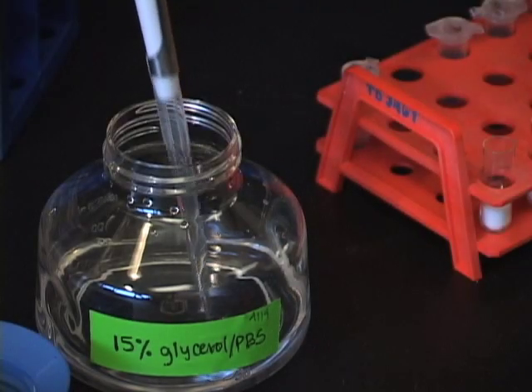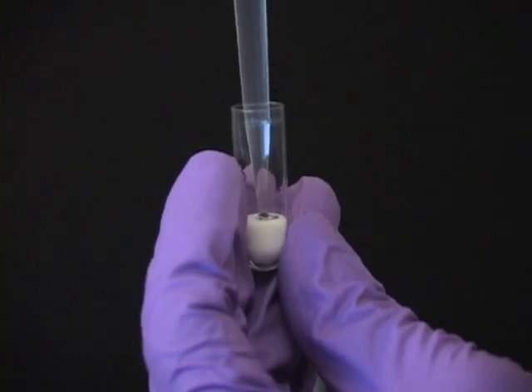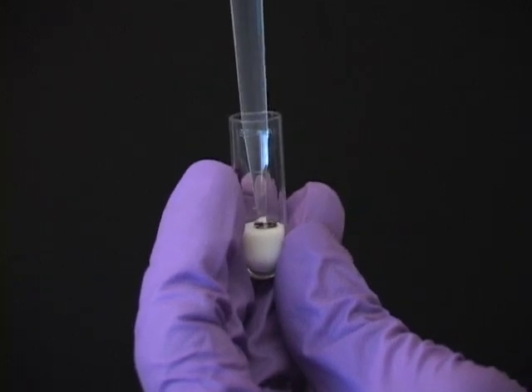Add 1 mL 15% glycerol in PBS, holding the coverslip in place with the tip of your pipette.